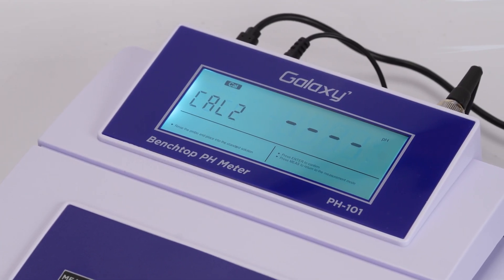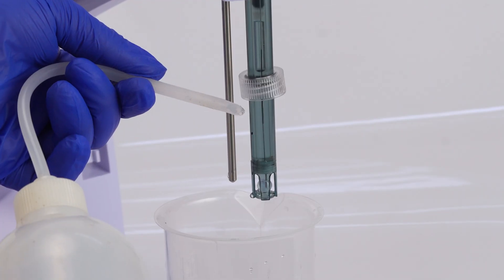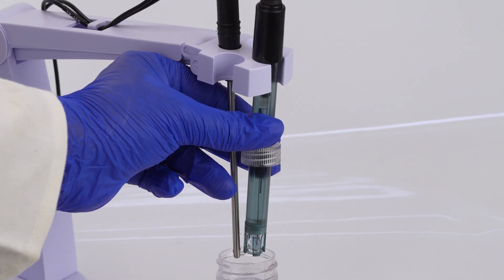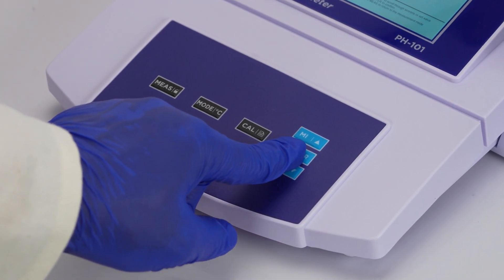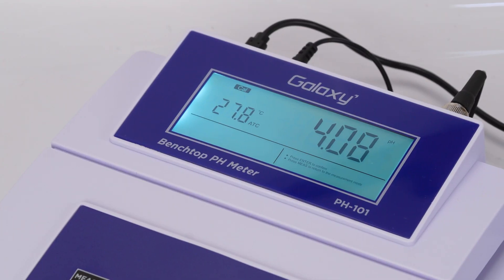When cal 2 displays, rinse the electrode, immerse it in the second buffer pH 4.01, and press enter.